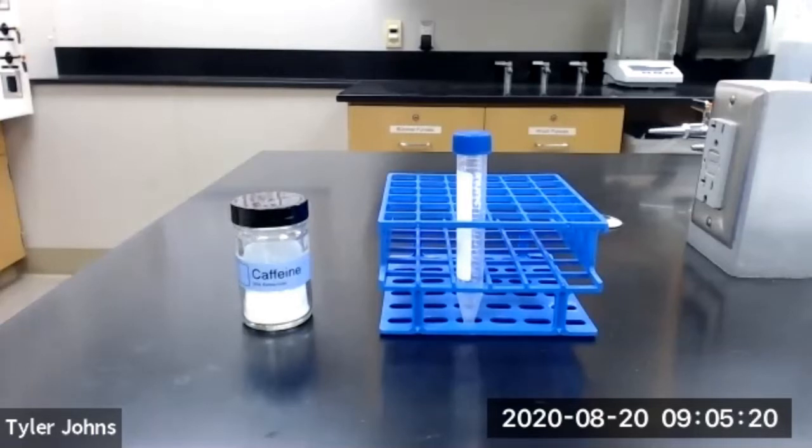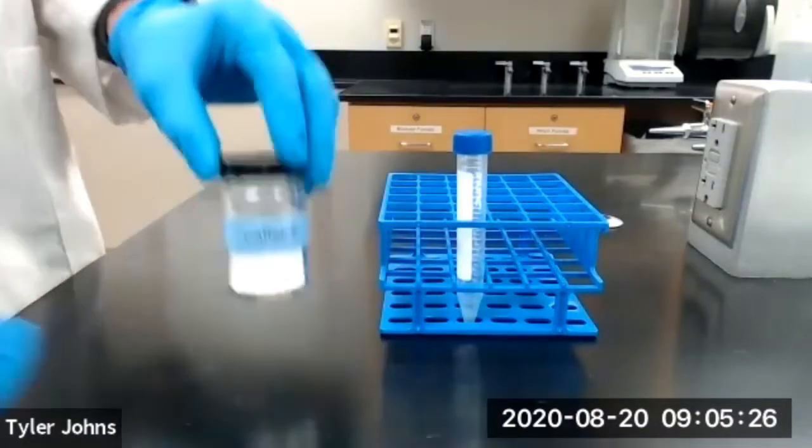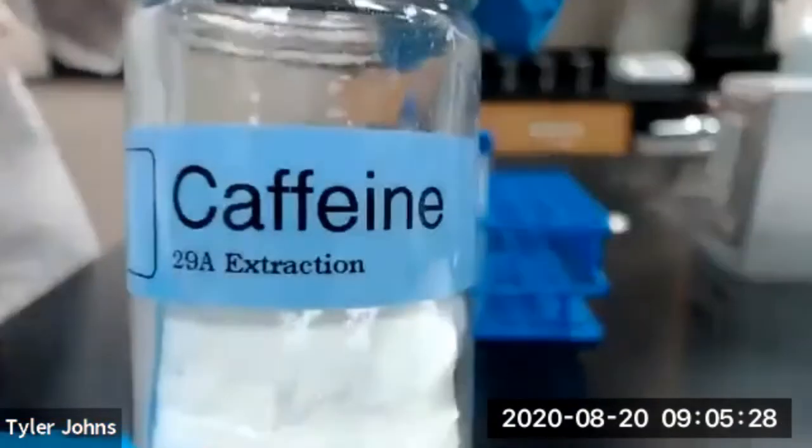In part A of this experiment, we're going to be performing an extraction of caffeine using methylene chloride. We first need to add approximately 70 milligrams of caffeine to a screw cap centrifuge tube.